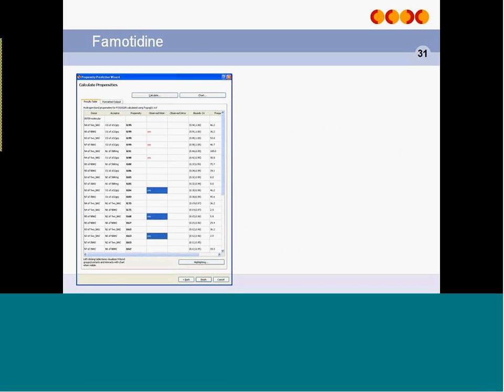But this is the beauty of the tool, really. We can take that polymorph, run it through the hydrogen bond propensity tool, and see a table like this. So we've got our donors and acceptors and our propensities for those hydrogen bond interactions. And we can see that we've got some good stabilizing interactions present in this polymorph, but we also have some interactions in the mid-table area. Some of them are starting to get a little bit more marginal.